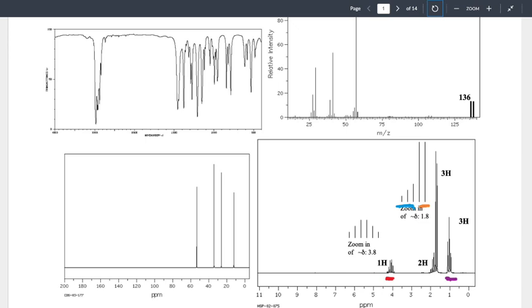What does that 2 and 6 mean? The number of hydrogens it counted. Where did it count those hydrogens, though? Not across a single molecule, but thousands of molecules. So when we say 2 and 6, this is likely 2,000 and 6,000. Does that mean there's 6,000 hydrogens on my molecule? No, it just means when I test 1,000 molecules, there are 6,000 hydrogens like that.